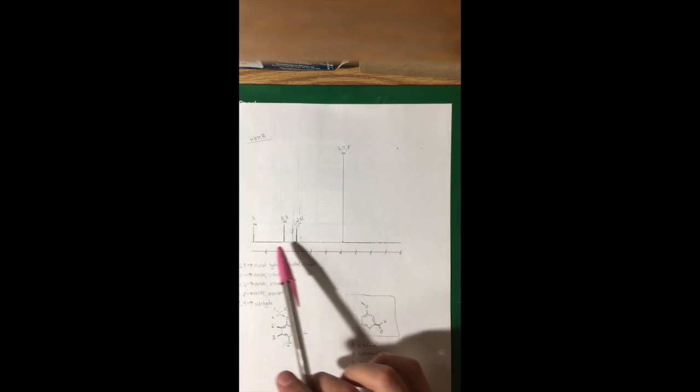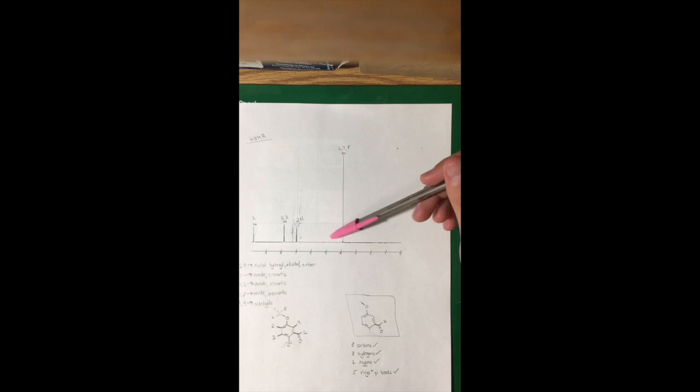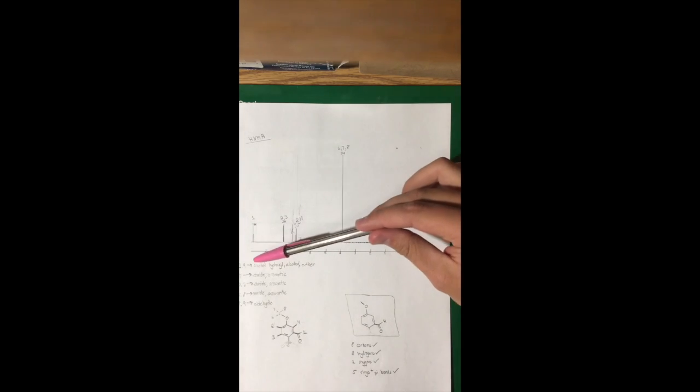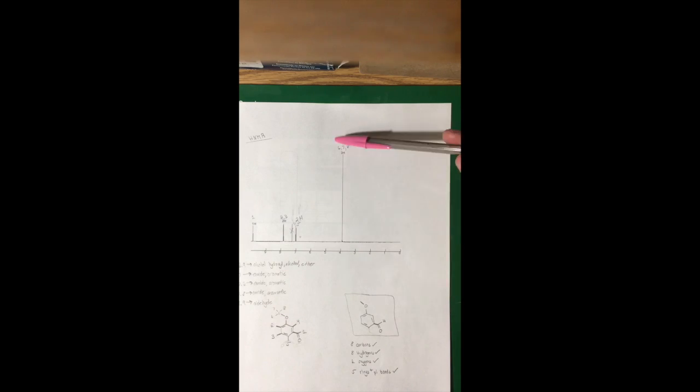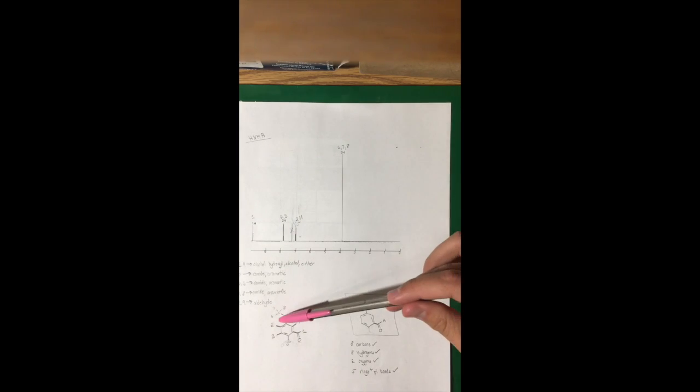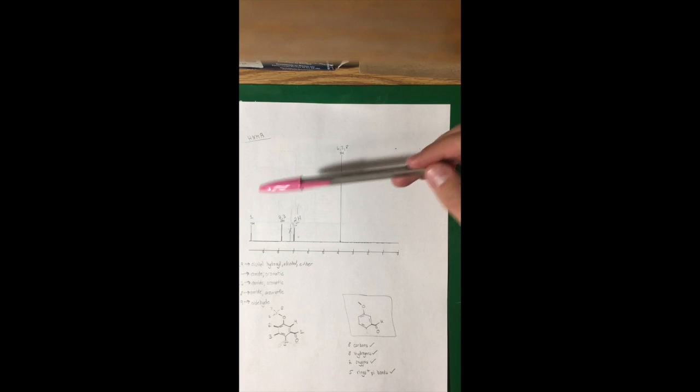So we look into the placement of these peaks within the graph. This first one right here, at 3.9, correlated to 3 hydrogens, is found to be an ether, which correlates to this: the hydrogens 6, 7, and 8 that it integrates to are right next to the ether.